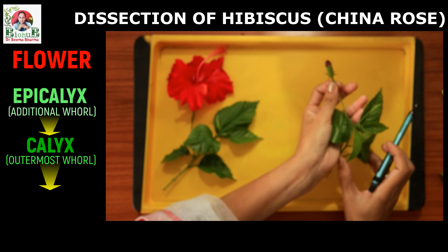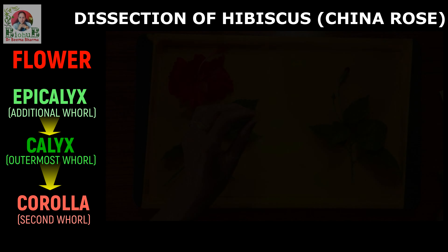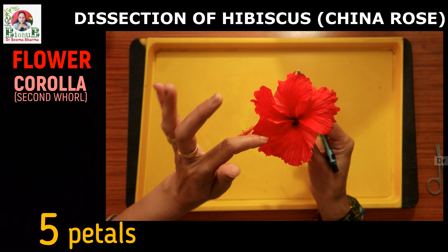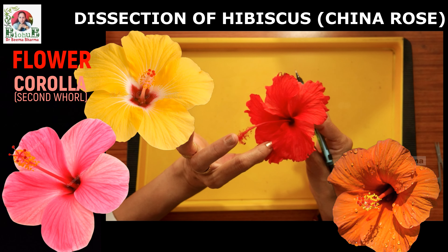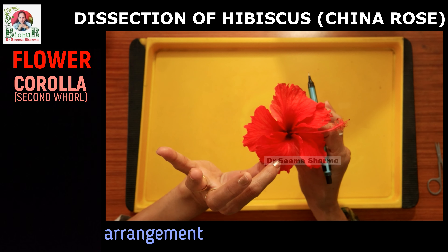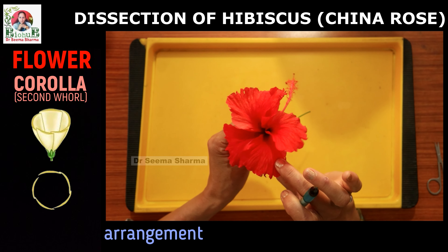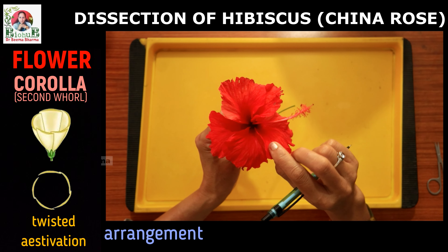Next comes the second inner floral whorl. Its technical name is corolla. Corolla comprises of five prominent attractive petals. In this China rose they are red in color. However, the petals of hibiscus can be of a wide range of colors like pink, yellow, orange, and white. Now see the arrangement of these petals — the margin of one petal is overlapping with the other. This kind of arrangement is called twisted aestivation. Knowledge about this aspect of corolla helps us to draw the floral diagram.